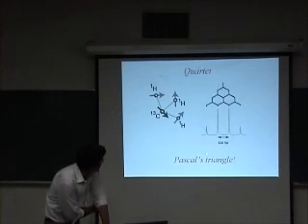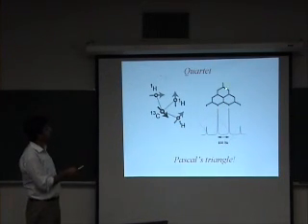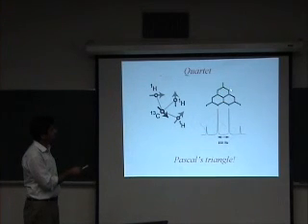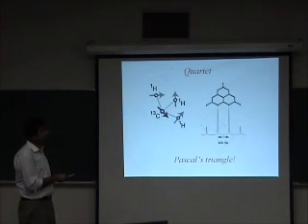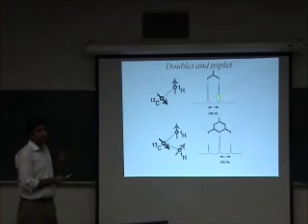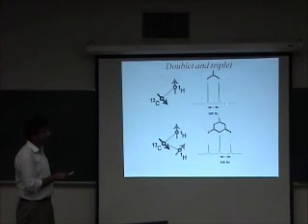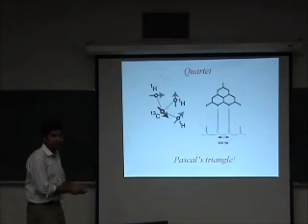और अगर हम इस बात को आगे बढ़ाएं तो in a methyl group the carbon is coupled to 3 protons, and if you look at this diagram, this is the first level of splitting, the second level of splitting, and then the third level of splitting. So the ratio is 1 to 3 to 3 to 1. So this is the quartet. So you will observe that the relative intensities of these peaks follow Pascal's triangle, ratio 1 to 1, 1 to 2 to 1, 1 to 3 to 3 to 1.